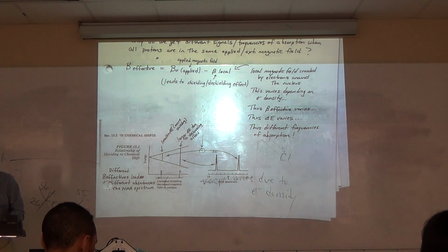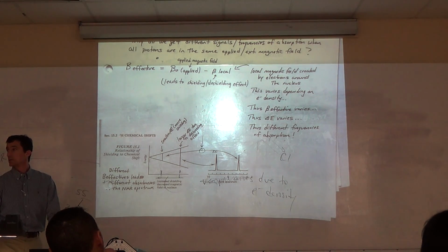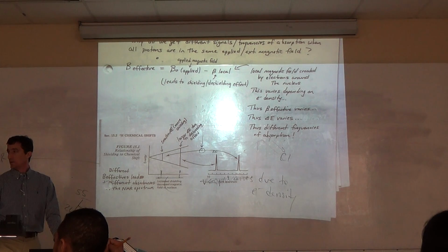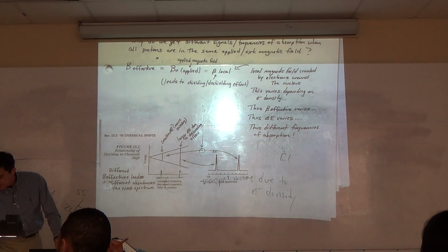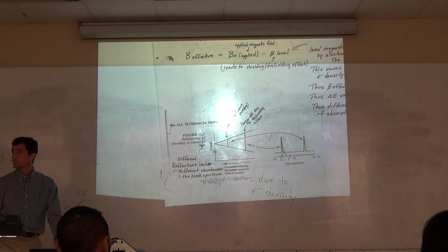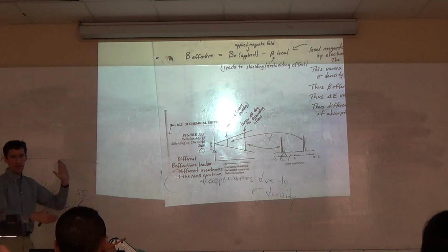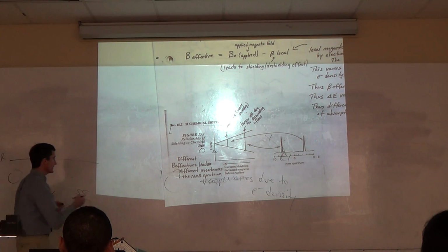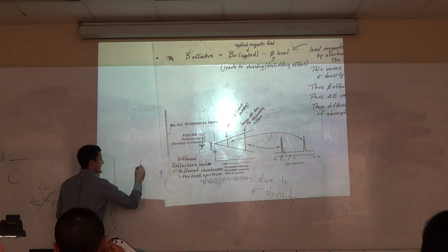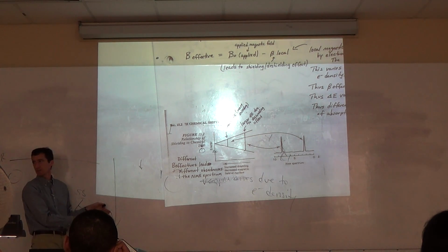Dr. Stevens, so if that induced magnetic field by the electrons is what causes more shielding to happen, since it counteracts this? Yeah, exactly. Does that mean de-shielding would be if the induced magnetic field matches the one that's up below? Now, de-shielding is just sort of the opposite of shielding. It's never going to add to it. It'll just be less. And so we call this shielding. We say that's de-shielded only relative to it, it's not as much shielding as this.